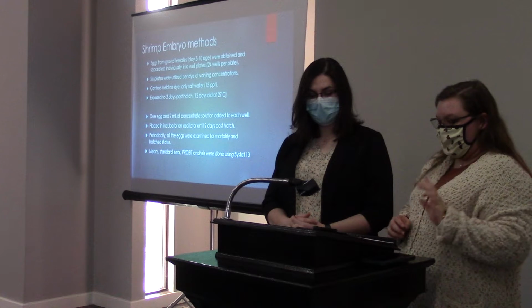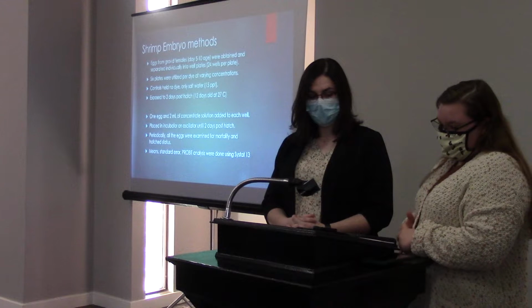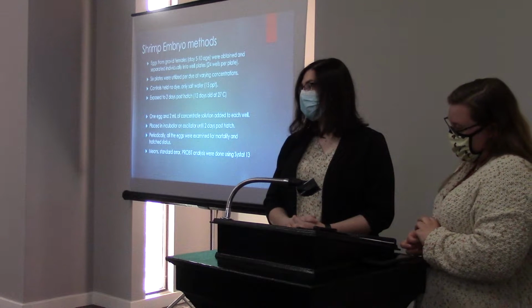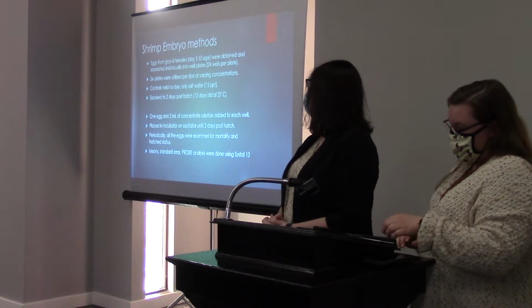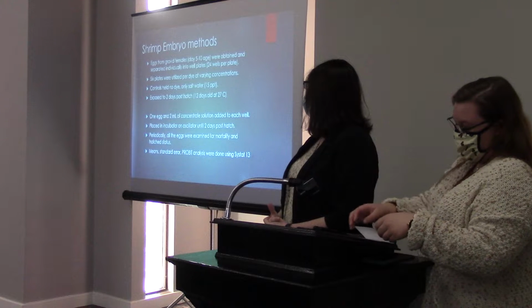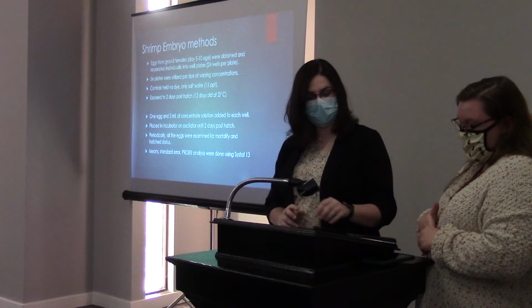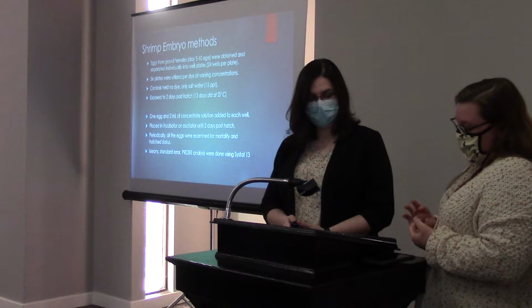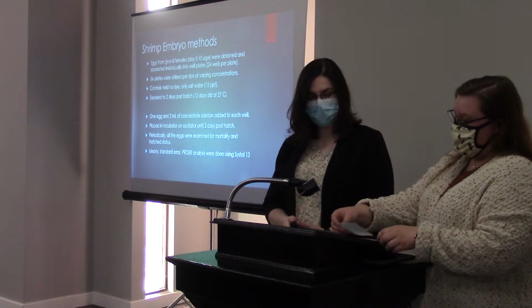They were exposed for 2 days post-hatch, about 12 days, at 27 degrees Celsius. 1 egg and 2 milliliters of concentrate solution were added to each well, and then placed in an incubator on an oscillator until 2 days post-hatch. Periodically, all the eggs were examined for mortality and hatch status, and the mean, standard error, and probit analysis were done using SysStat.